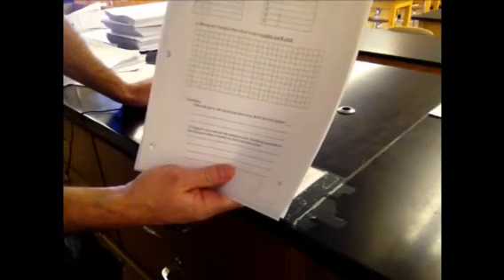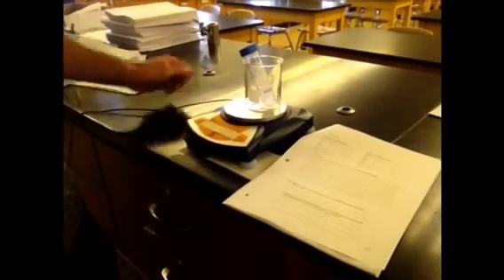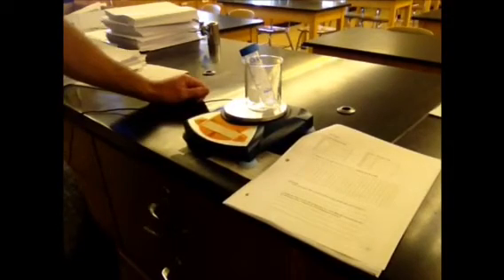Now, what we're going to end up doing is collecting the class data for change in mass. Did it go up? Did it go down? What happened there? And then we're going to have a little discussion about open systems versus closed systems, and we're going to make a histogram. It is a certain type of graph where we can compare everybody's data. But that's the way this lab goes. Overall, it's pretty straightforward, I think. Just make sure that cap is on there as tight as possible before you put the Alka-Seltzer into the vial.